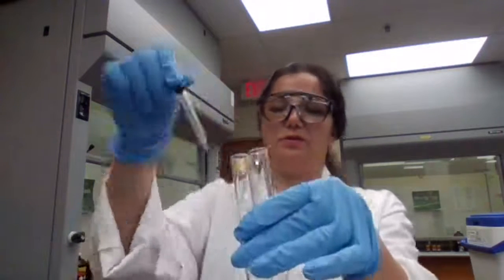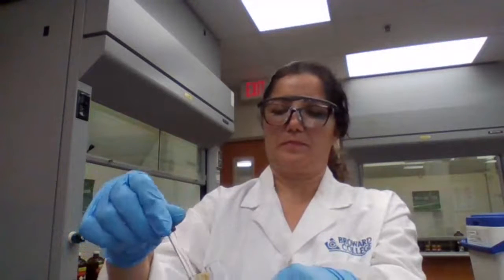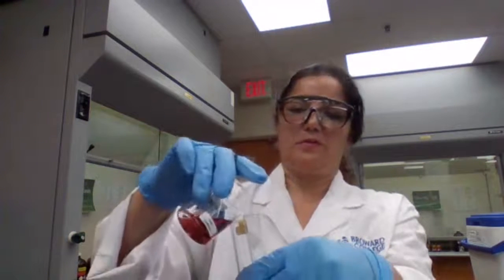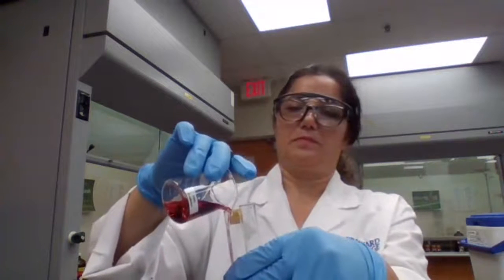About 2 droppers. It's going to be 1 milliliter. So I'm adding cobalt to both test tubes, 1 milliliter each.